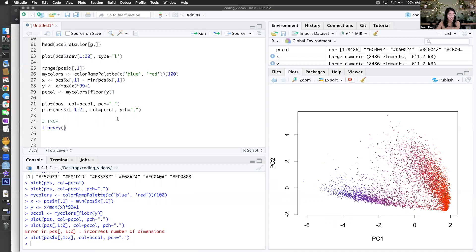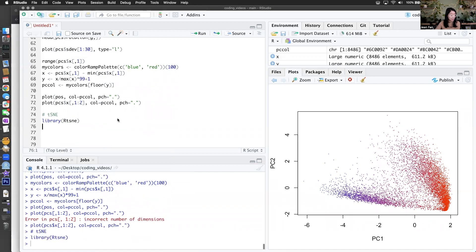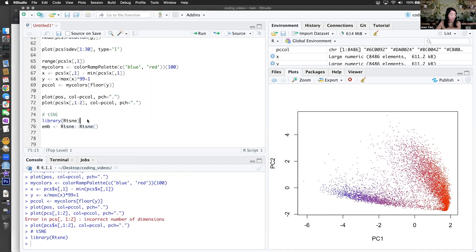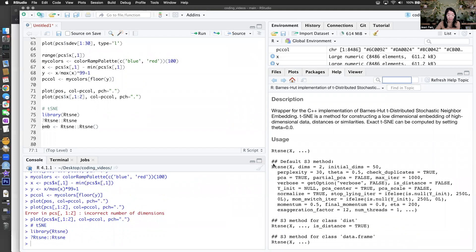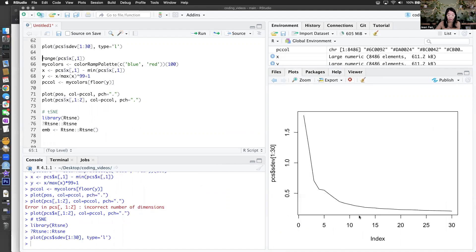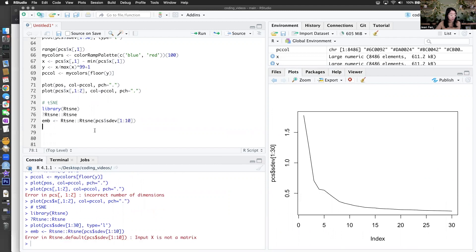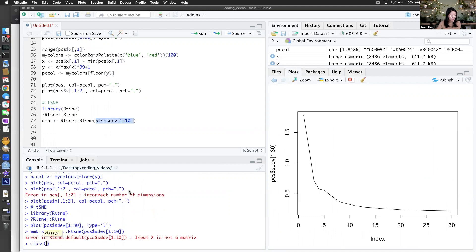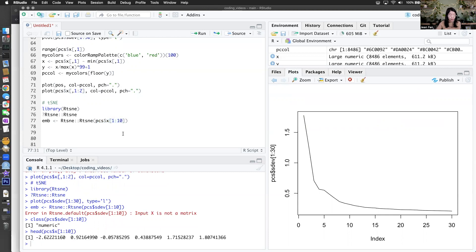This is the one area where students will need to install a package — I don't want to implement gradient descent from scratch. So let's run our t-SNE. I'm going to run it on the first 10 PCs, since we saw that they captured most of the variance. Oops — input is not a matrix. I was running it on the standard deviation vector — I'm supposed to run it on the principal components matrix. It's always good to double check what your input is.